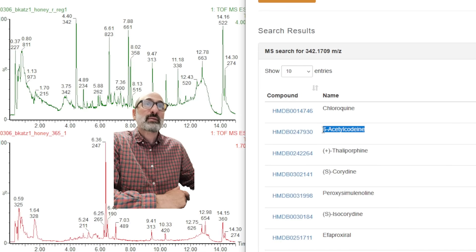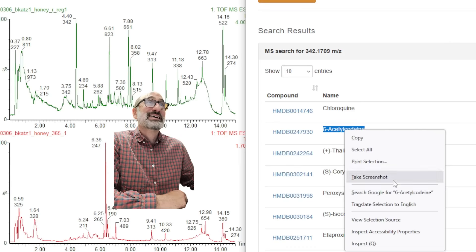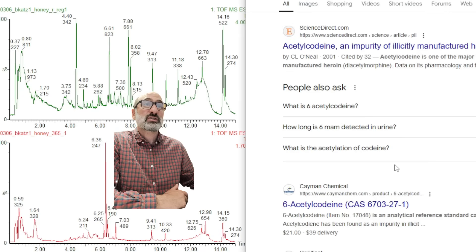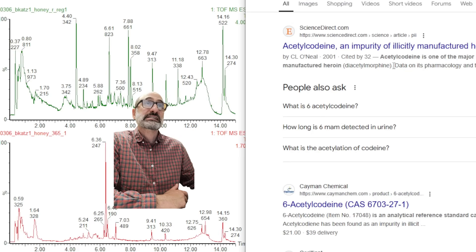If we look at the fragmentation ions on this acetyl-codeine, they actually do match the peaks that we were seeing. Some of them match. Acetyl-codeine, kind of scary. Definitely not supposed to be in there. It is a major impurity in illicitly produced H.